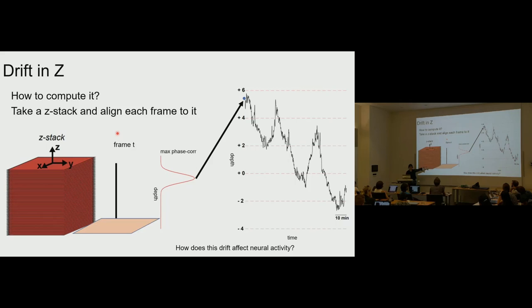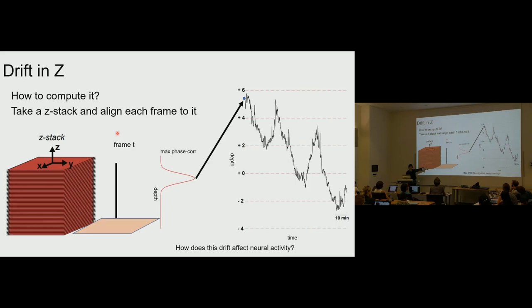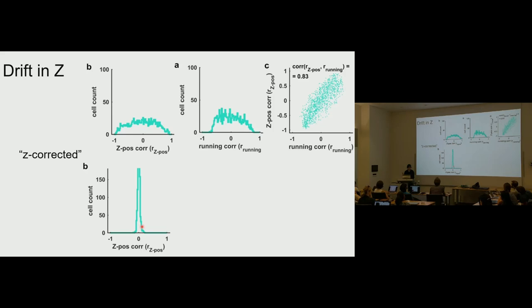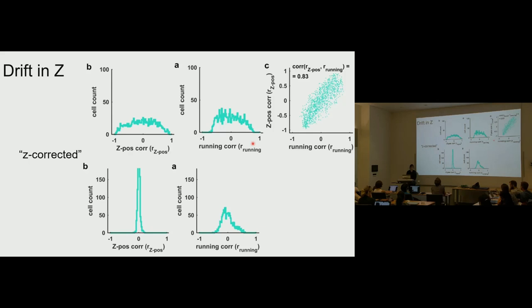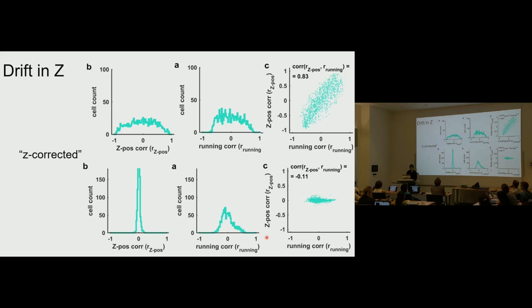After performing Z correction — subtracting the Z trace off from the baselines of each cell — the cells are no longer correlated with Z position. The running correlation also becomes much smaller. There are still some cells correlated with running, which is expected since running-correlated activity in V1 has been validated in electrophysiology recordings. But the running correlations are not as large as without Z correction. This is an important confound to be aware of in your own recordings.